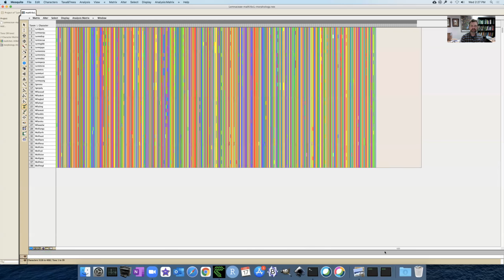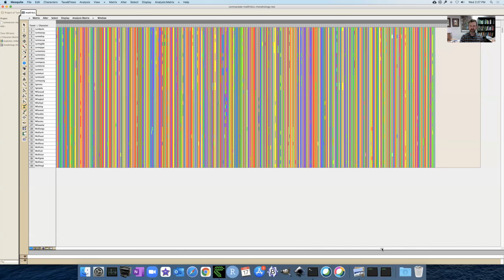So across this is a plant family. Some people call it a subfamily, but I'm going to stick with plant family here. We can see some regions where things are almost identical across all these species, right? So lots of identity in this region, a little bit more variation here, especially the gaps that exist in this region.